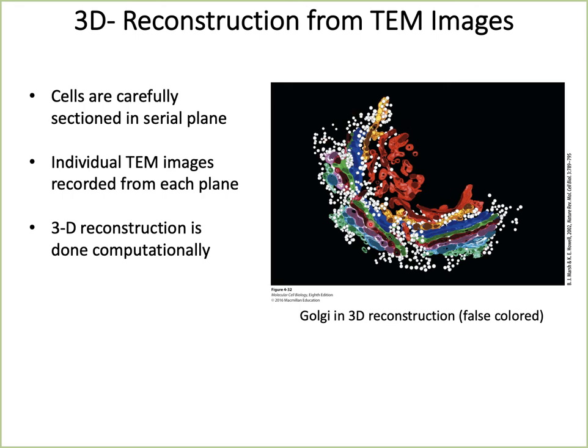What you are seeing is that these are the small white vesicles. These are the transport vesicles, which arose from the endoplasmic reticulum, and they are coalescing, or fusing, with this cis face of the Golgi. So this is the receiving cis face of the Golgi, but you do not see them on the trans face.